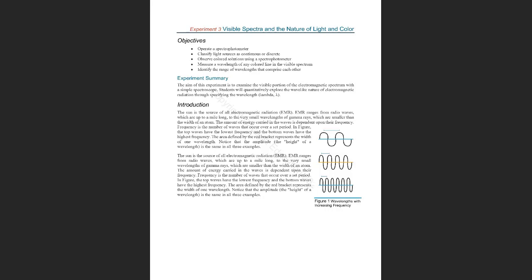Number four, we need to learn to identify the wavelength of peaks of colored solutions and the wavelengths where the absorbance is 0. And the last objective is to understand the relationship between the color that our eyes see and the energy absorbed by the colored solutions.